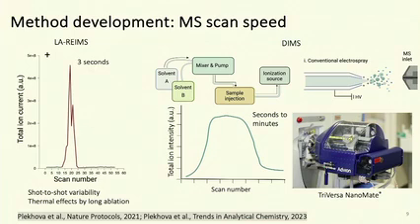So over that prolonged sample signal, we can include scans of lower speed, and we can employ mass analyzers that cannot keep up with high scanning speeds, but we will gain precision in mass handling. We can also include MS2 scans within this prolonged signal without losing quality of MS1 data. So it can be something to consider at the point of data acquisition, at the point of method development.